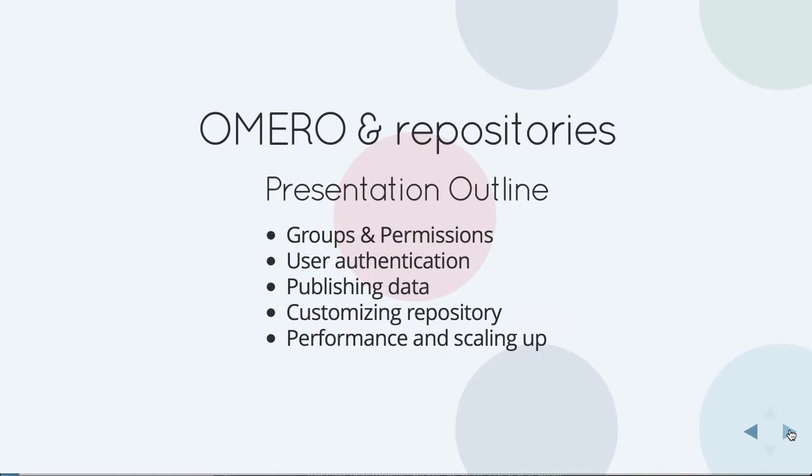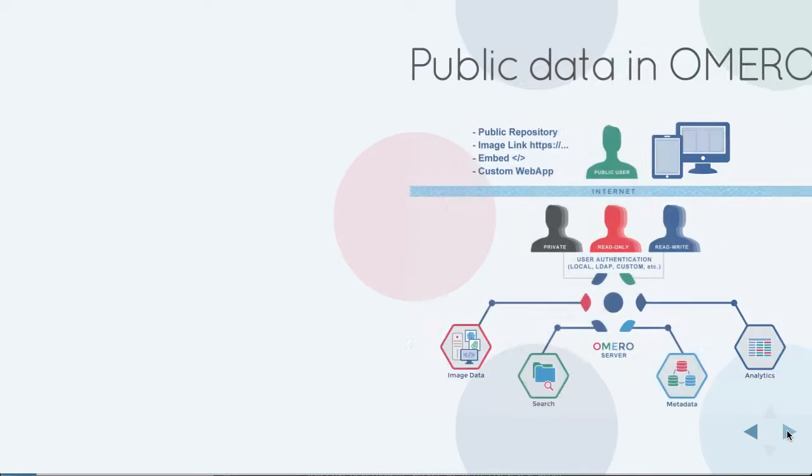My presentation will mostly cover how groups and permissions work in OMERO, user authentication, publishing the data, customizing a repository, especially web, and performance and scalability.